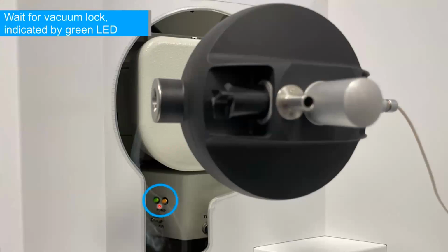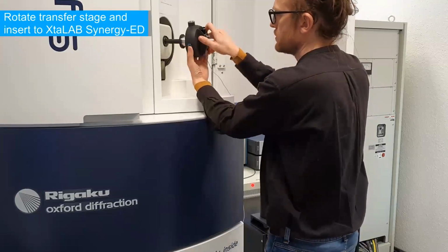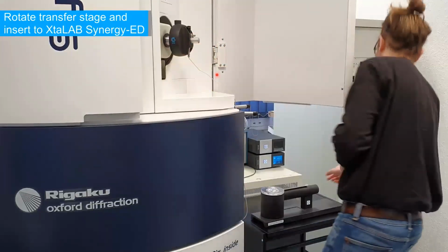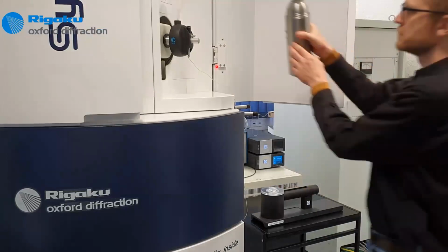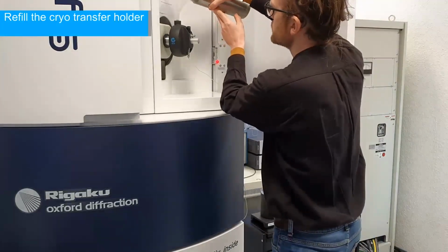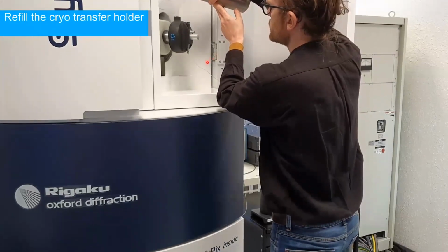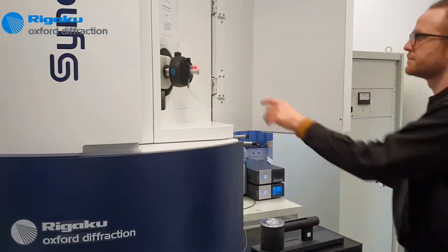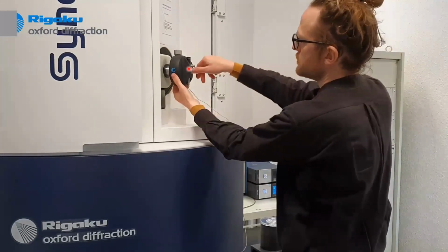This takes a minute or two, as I said, and then afterwards you get literally green lights for fully inserting the sample into the diffractometer by rotating it, which opens a gate valve mechanism. And now it is inside the diffractometer at the interaction point with the electron beam. As a matter of best practice, the next thing I'm doing here is topping up this dewar, which will maximize the holding time, which can be up to 10 hours in theory, which is honestly something we never really need, but easily enough for any sort of measurement.